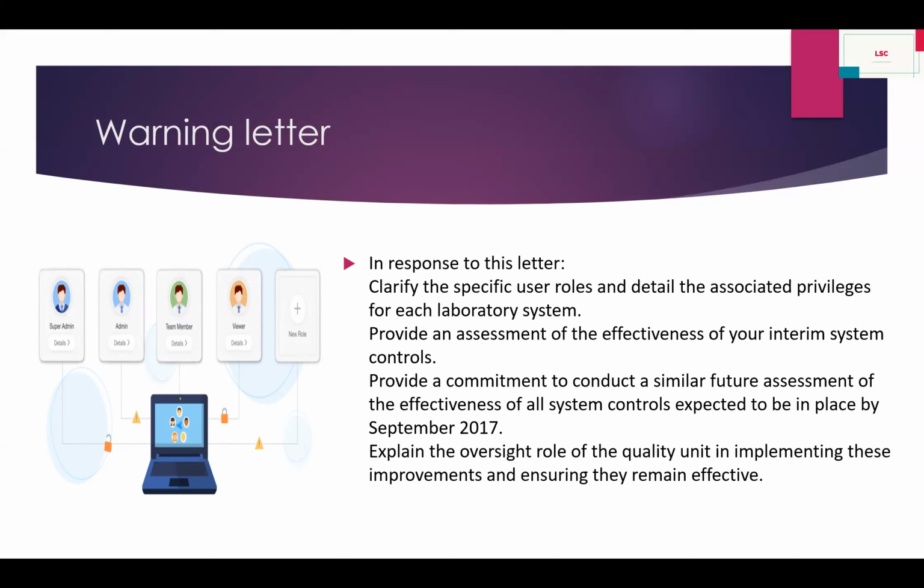So ensure this not only for the HPLC system or the quality control system, but for the whole facility. Whatever automated, electronic, or software systems you have, think about them in your risk assessment, define your resource control, and prove you made the right decision to give privilege and access to the right person.